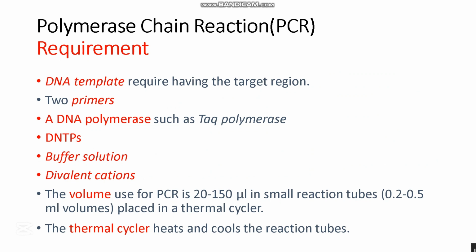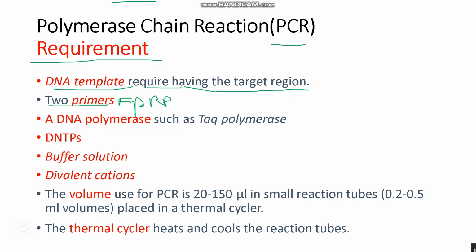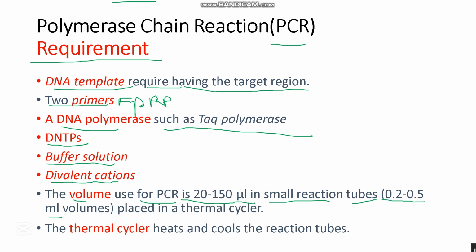So for the PCR, what are the requirements? First of all, we use the DNA template, which requires having the target region, and two primers: the forward primer and the reverse primer. And the DNA polymerase, such as Taq polymerase, the dNTPs, the buffer solution, and the divalent cations. The volume used for PCR is 20 to 150 microliters in small reaction tubes of 0.2 to 0.5 milliliter volumes placed in a thermocycler. The thermocycler heats and cools the reaction tubes.